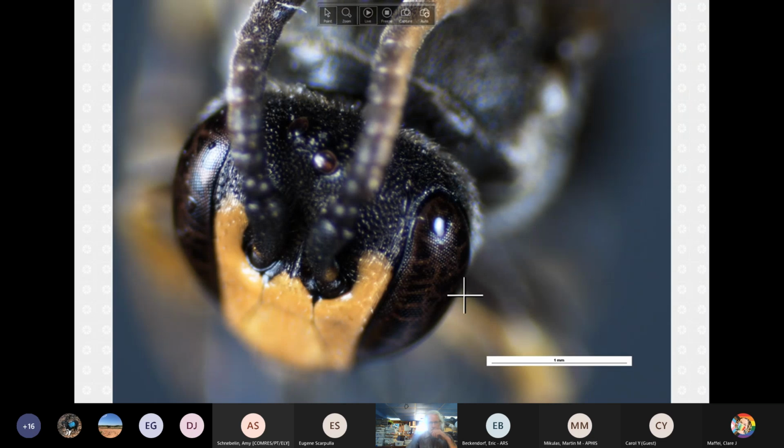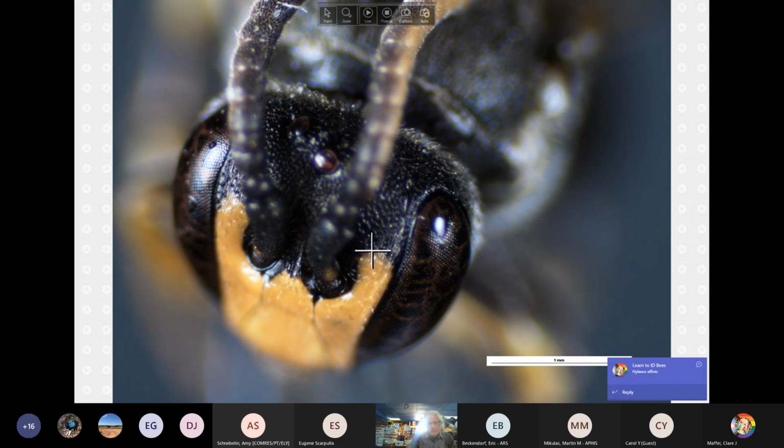So here's a good example. Often in affinis, you get these clipped tops, so it looks almost exactly like modestus. This is not something that you can count on, but the fact that it comes up and cuts over, truncate I guess would be the call, is useful.